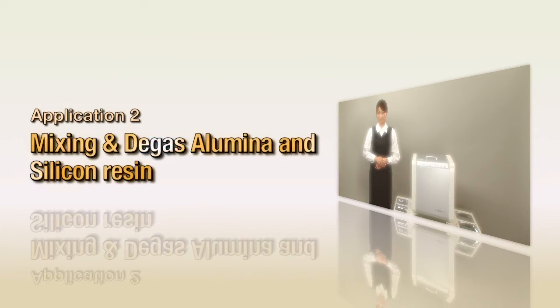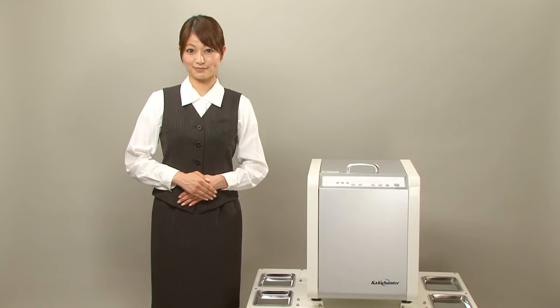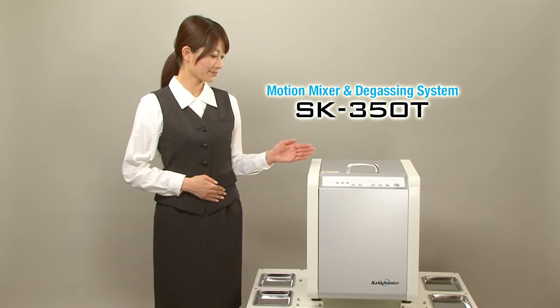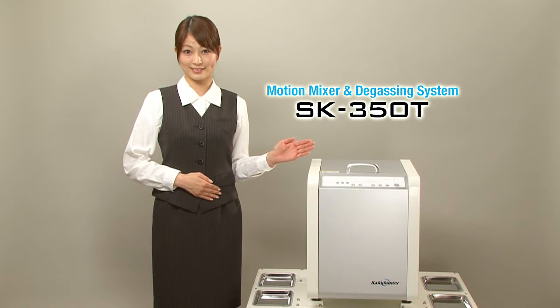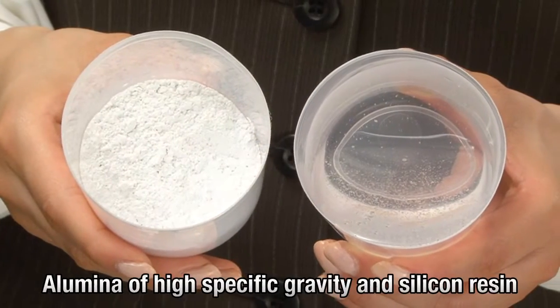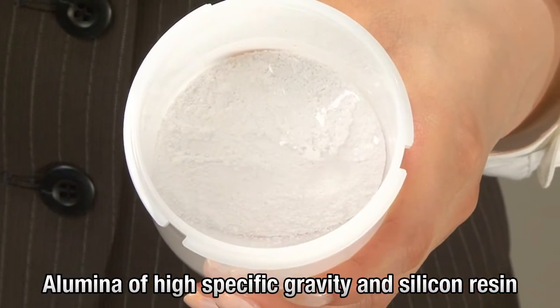Mixing and degassing alumina and silicon resin. Next, we will use the SK350T in the step mode in order to mix powder and resin into a paste and degass the material. First, we prepare the materials. Here, we are using alumina of high specific gravity and silicon resin.